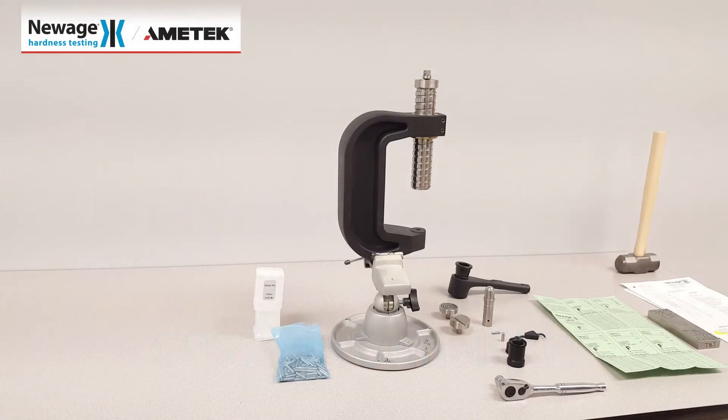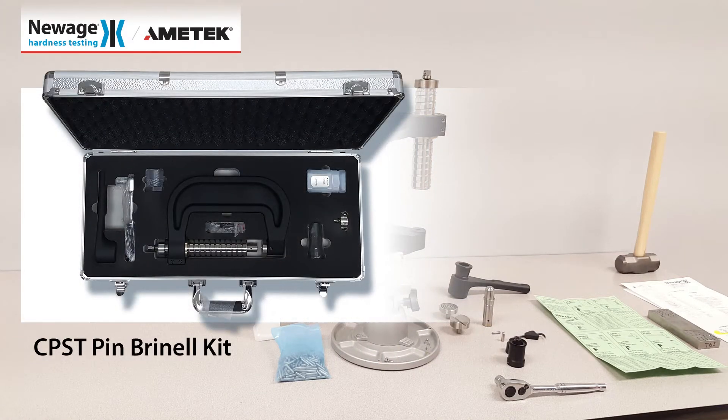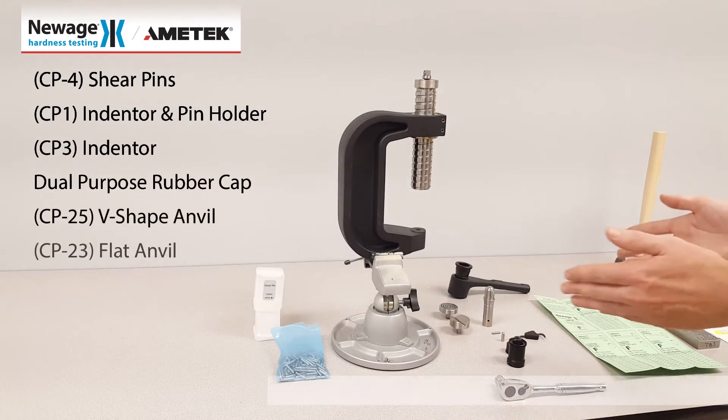This is an instructional video for the Pin Brinell test method. The test kit CPST includes everything shown here.